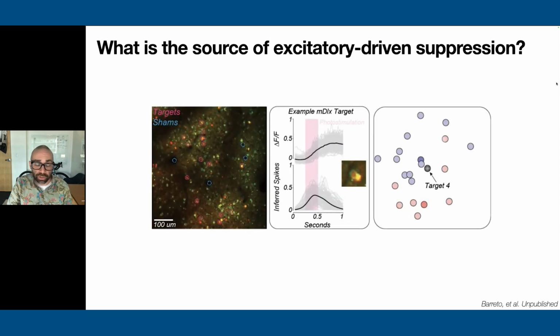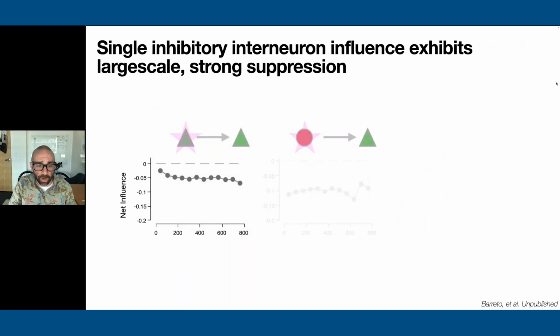And so we've actually done a bunch of experiments now where we photostimulate inhibitory neurons to look at their effects on surrounding excitatory neurons. So this is a similar experiment. There's a couple little tweaks here because interneurons are a little bit harder to drive. They have a little higher firing rates, but more or less we got this to work. And we use the same strategy.